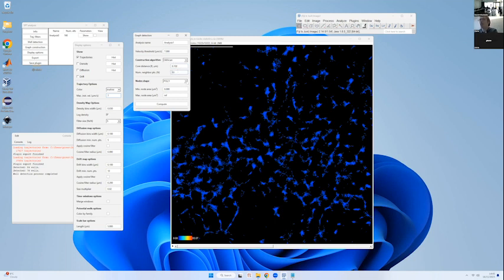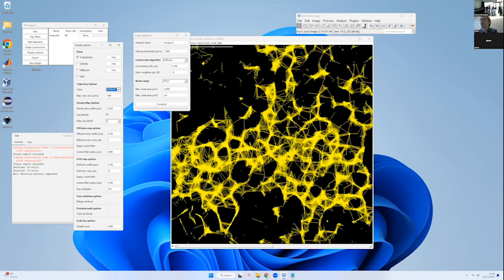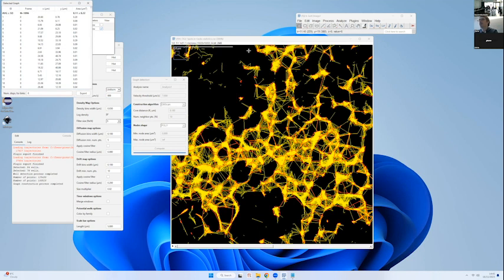And the node shape, you don't really care, polygon or ellipses. So if I just go back to my trajectories, and now I do compute. Now it's going to compute the graph for each time window. Done, and as before, you can see that analysis 1 is here. I can see the parameters, and now I can also see the graph.